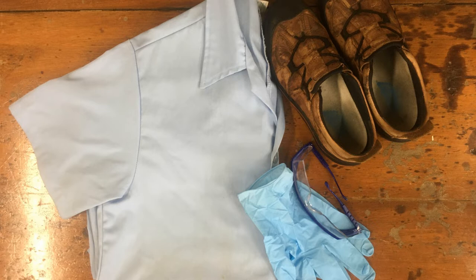Remember safety gear when working in the lab: our lab coat, safety shoes, gloves, and of course our goggles.